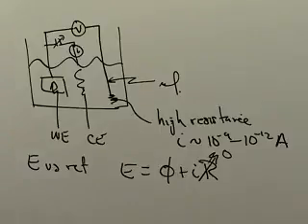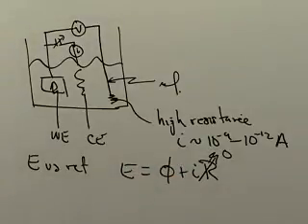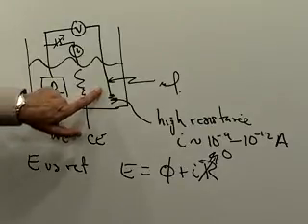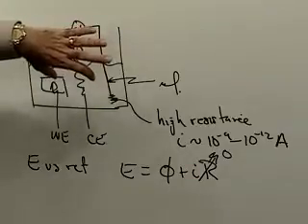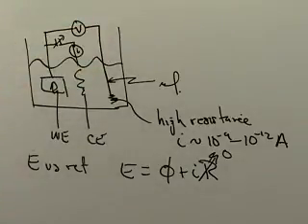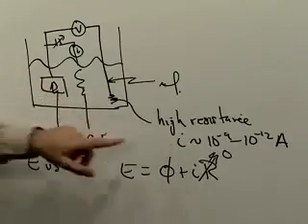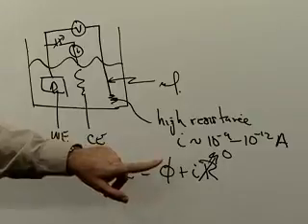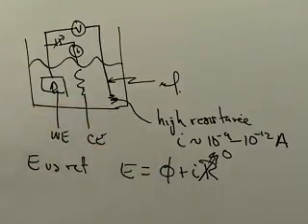So we could certainly handle a millivolt, no problem. Of course, one could build a reference electrode with a low resistance and just be subject to the resistance of the cell. But from day to day, you make different cells with different resistances, so you can't be guaranteed that the current flow through that part of the circuit will be small. So you actually want to put a high resistance there, which is in series with your solution resistance, since series resistances add, so that you are certain that your current is small.